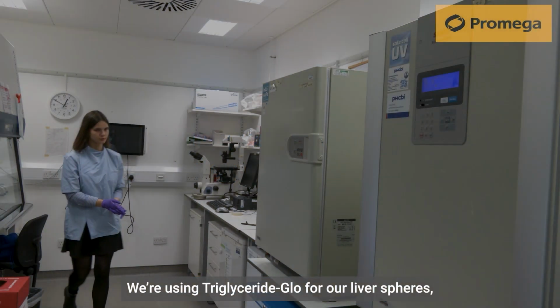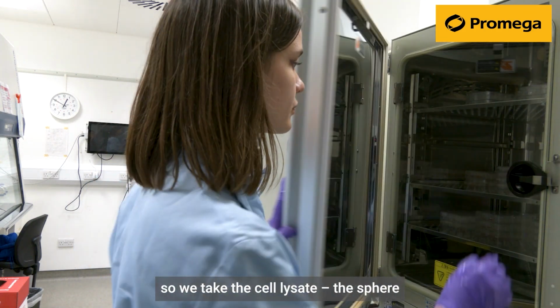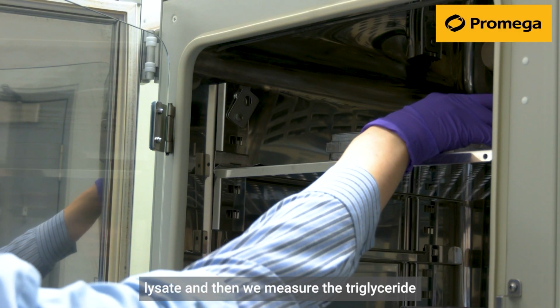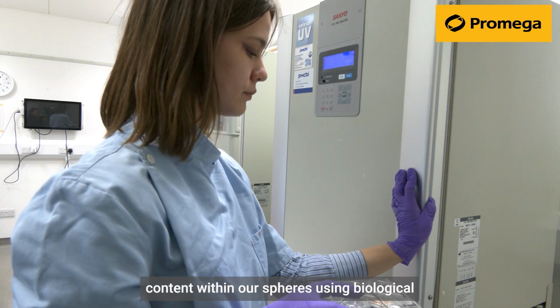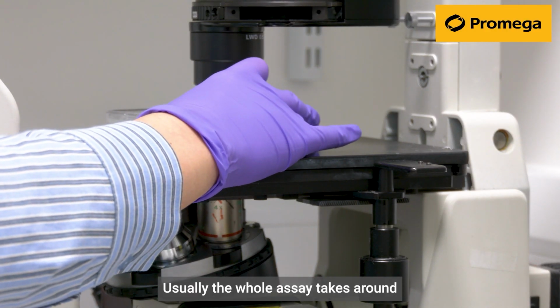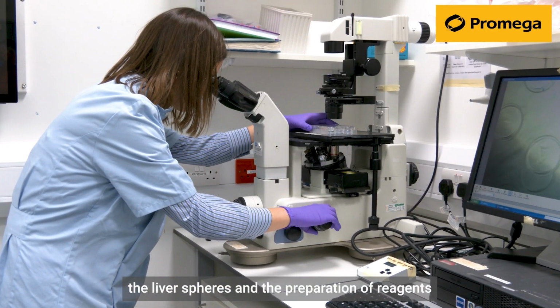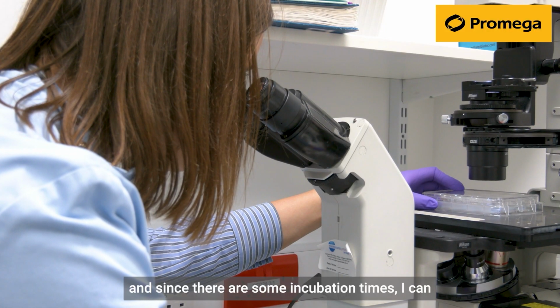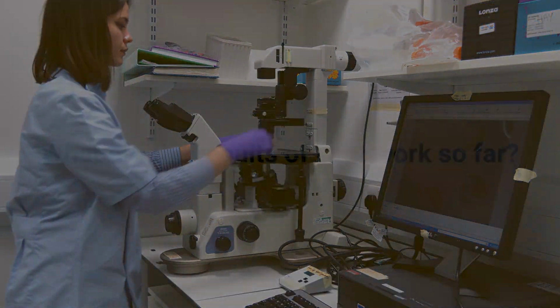We're using Triglyceride-Glo for our liver spheres. So we take the cell lysate, the sphere lysate, and then we measure the triglyceride content within our spheres using biological and technical replicates. Usually the whole assay takes around 2-3 hours to complete, and I'm starting in the morning with the harvesting of the liver spheres and the preparation of reagents, and since there are some incubation times, I can do other lab work or relax and have lunch.